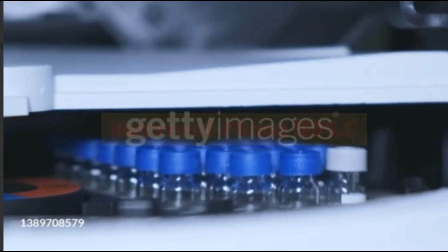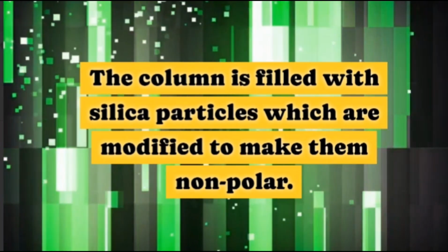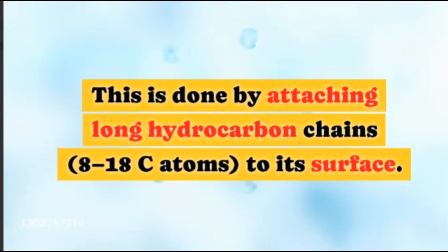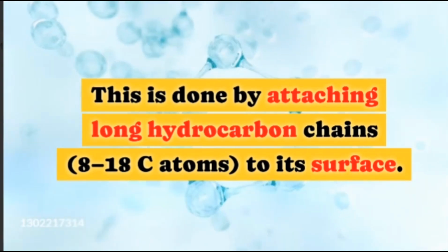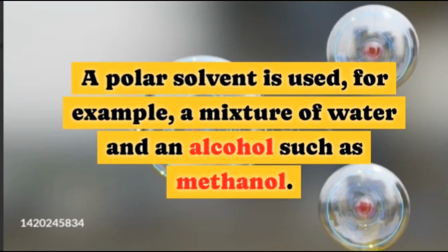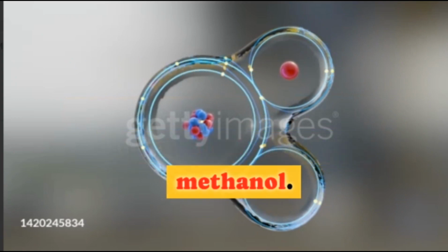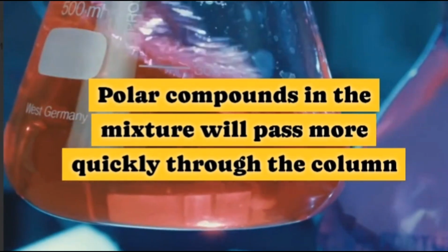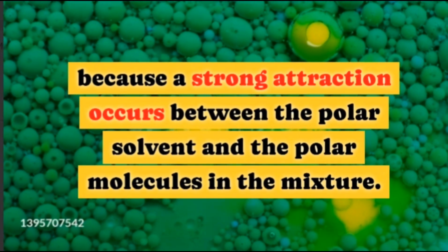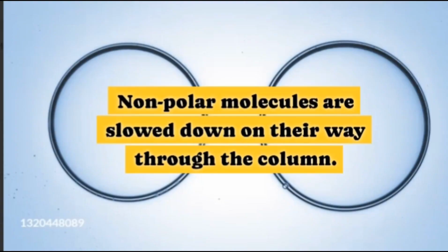Reversed phase HPLC. The column size is the same. The column is filled with silica particles which are modified to make them non-polar. This is done by attaching long hydrocarbon chains, 8-18 C atoms, to its surface. A polar solvent is used, for example, a mixture of water and an alcohol such as methanol. Polar compounds in the mixture will pass more quickly through the column, because a strong attraction occurs between the polar solvent and the polar molecules in the mixture.